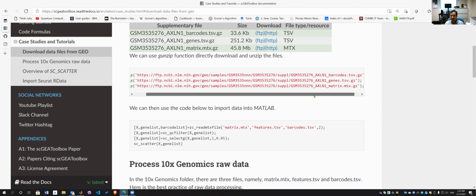Okay, you can try the same as well because this is a good example you can try, because I want to know after unzip what the file name is for each of these. So I will rename this, because this function will take the output of this. You need to provide the correct file name.